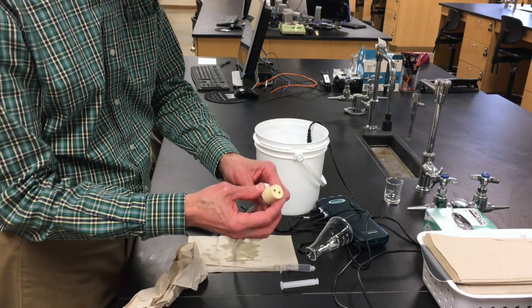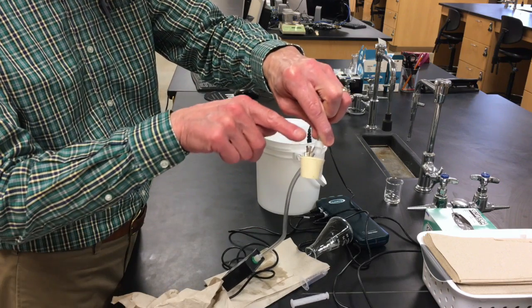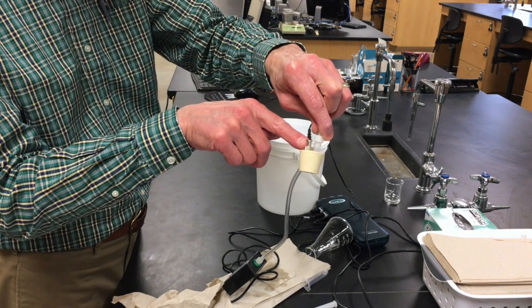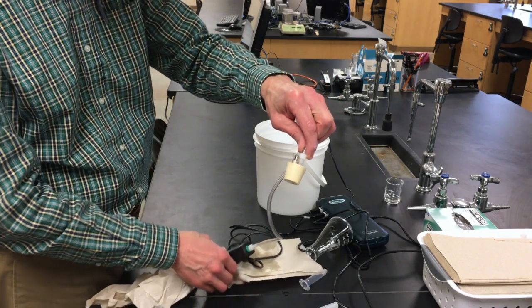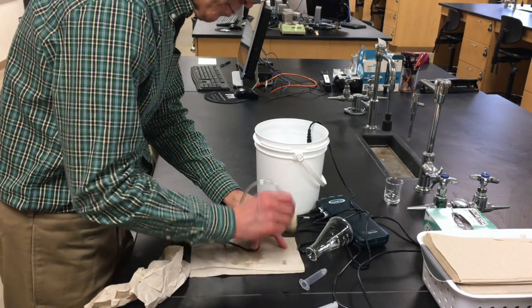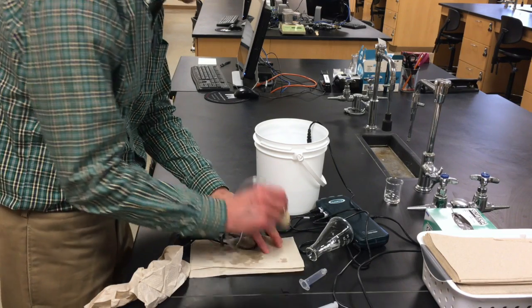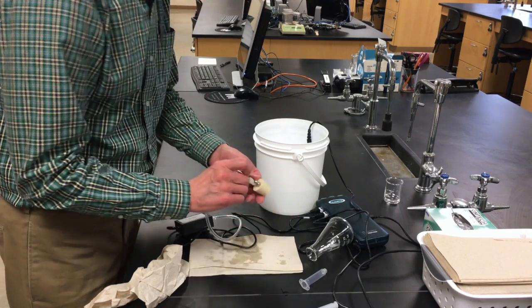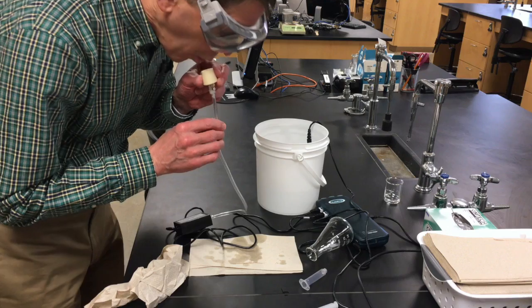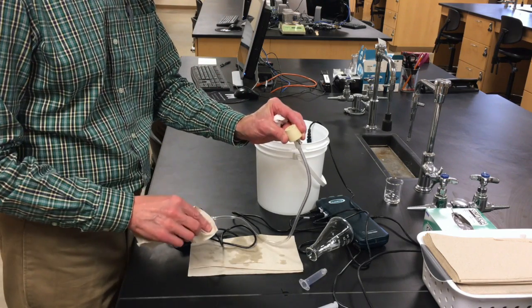The last thing, to avoid cross-contamination, is to get the liquid out of this plunger. We squirted ethanol through this metal port here, and we've got to get the ethanol out of there too. So again, you can bang that, and you see that some ethanol was coming out. It's wetting the paper towel. Do that till it's not wetting it anymore, and then maybe even blow through here to make sure that you get all of that out.